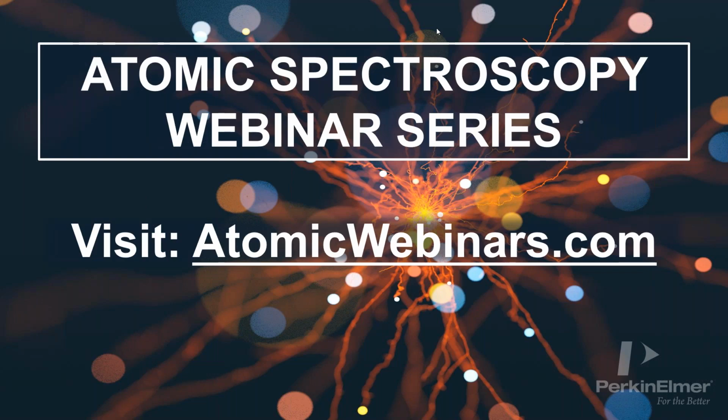I wouldn't be able to give you a comment based on experience for this. Generally speaking, platinum being a very high mass element, it suffers less from space charge effects or those nature which can skew signals. If you don't use an internal standard, and the signal intensity gets skewed by factors which are not correctly taken into account in a single cell experiment, then it could lead to deviations. But for platinum, I wouldn't expect that to be dramatically the case. So we would probably have to look a bit closer.